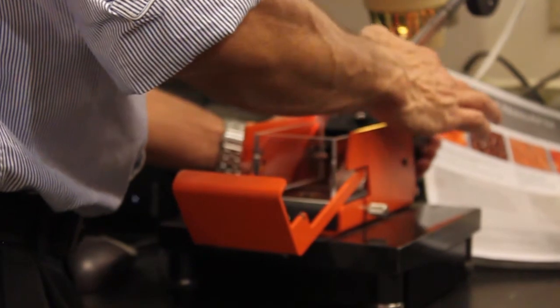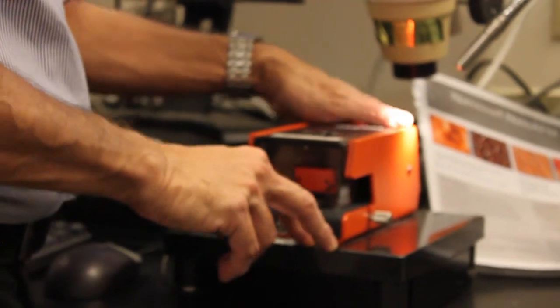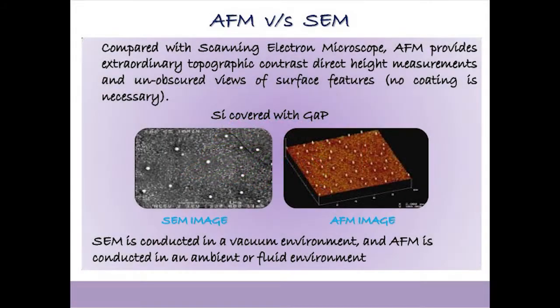Just like any other tool, an atomic force microscope's usefulness has limitations. When determining whether or not analyzing a sample with an AFM is appropriate, there are various advantages and disadvantages that must be considered. AFM has several advantages over the scanning electron microscope, SEM. Unlike the electron microscope, which provides a two-dimensional image of the sample, AFM provides a three-dimensional surface profile. Additionally, samples viewed by an AFM do not require any special treatments, such as metal or carbon coatings, that would irreversibly change or damage a sample.